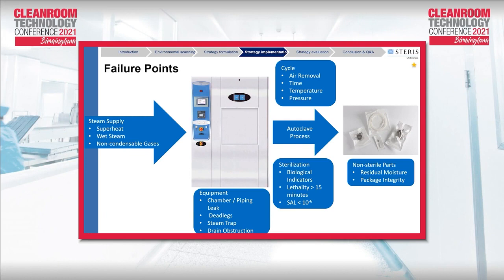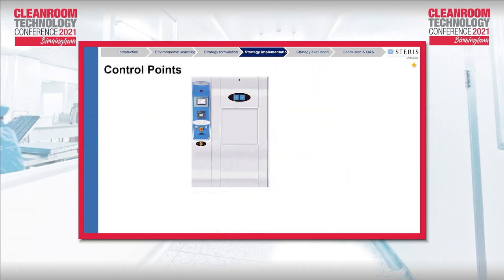And of course, if you do have residual moisture or packaging, that's been a visual inspection of your equipment after being sterilized, then it may give you an idea of the failure point. Now that we have understood the different failure points, and this is why you are mapping your process, you understand it's easy to define the adequate control points.